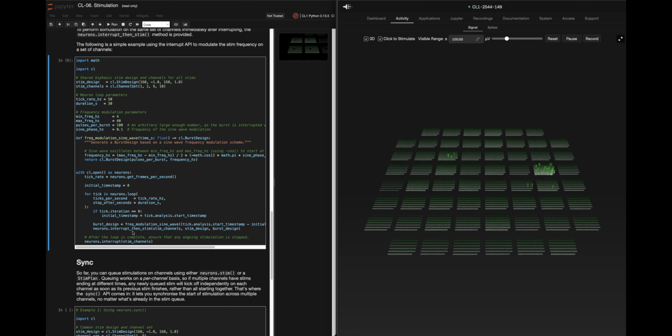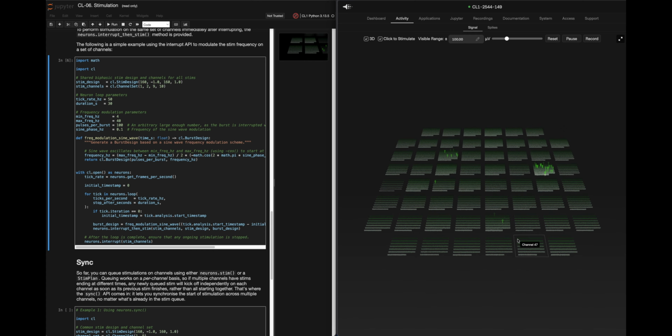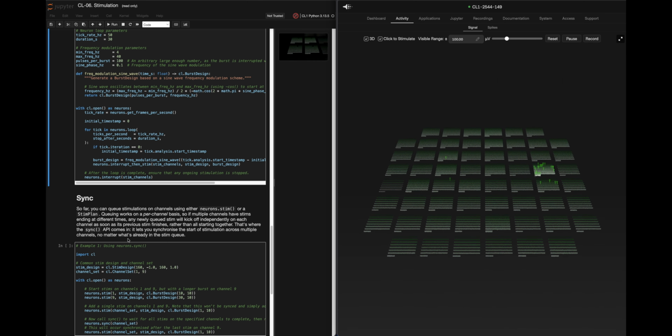Using this to interrupt longer running processes that you might not be looking over is super important for culture, health, and safety. So that's probably the way you're going to end up using it.